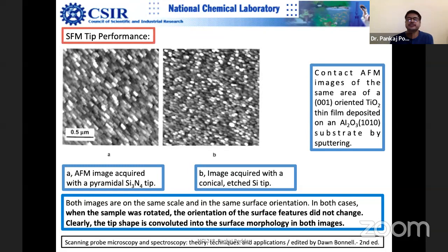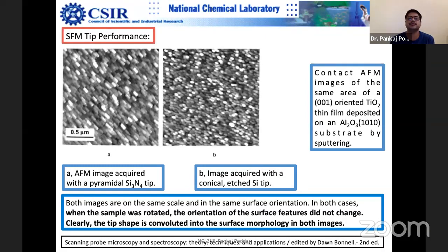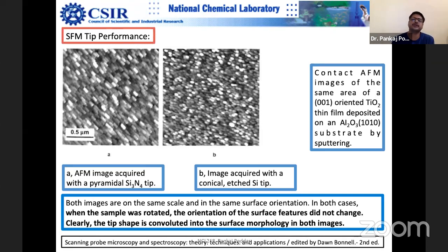One important check: if you rotate the specimen and the image also rotates by the same angle, then it is fine. But if the features do not rotate by the angle you have rotated the sample, that means those features are artifacts created by the tip itself. Sometimes the tip gets blunt.